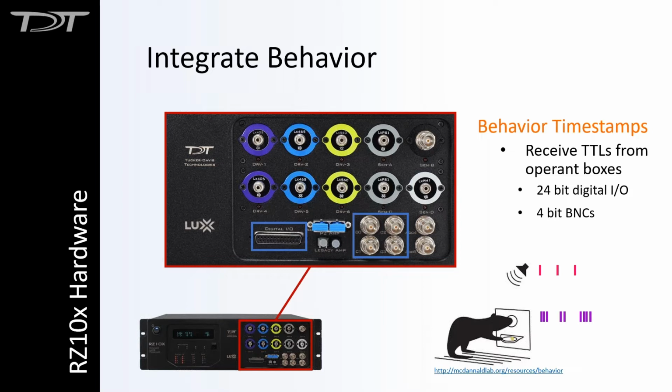I hope you don't mind, Jessica, but the LED drivers are very linear, as are the LED sources, and they can go linearly from as low as 1 milliamp, which would be in the microwatts, up to 1 amp, which would be in the milliwatts. Okay, cool. So 1,000 milliamps is the cap there then. All right.